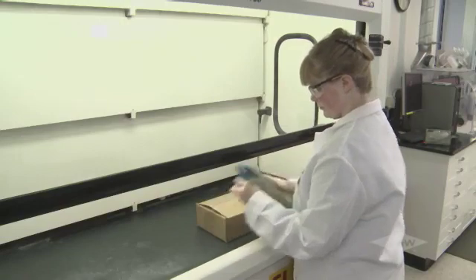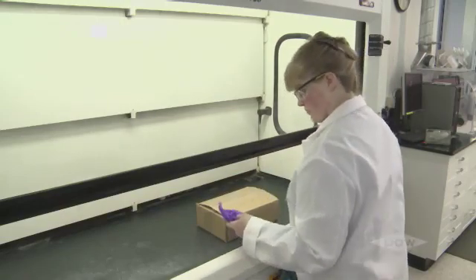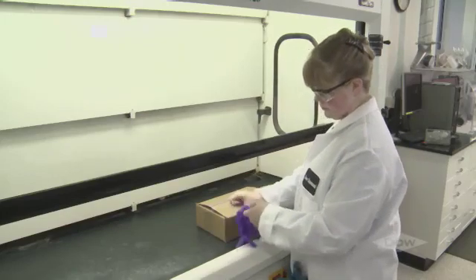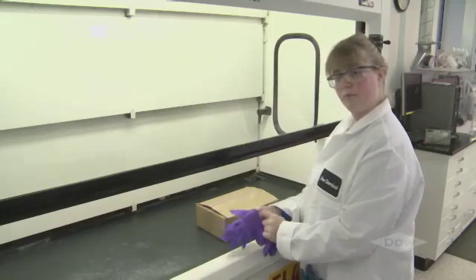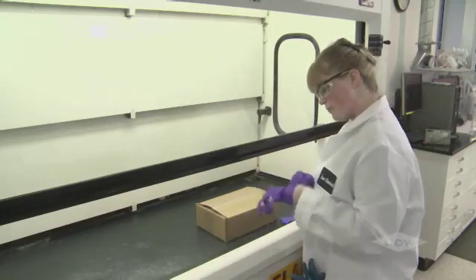She finally got that sample she was waiting for. It's an important part of her project, and she's anxious to get going now that it has arrived. But Gail, stop a minute and think. Could this become a near-miss situation? You never know if there's a potential hazard lurking in that box.